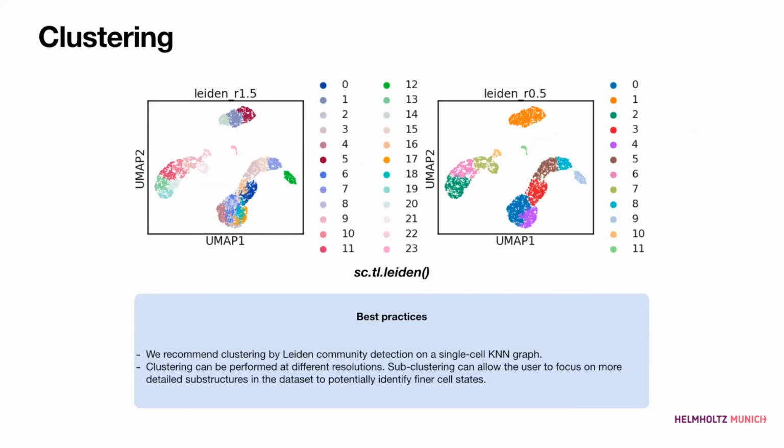Right. Good. Finally, this is the last big point that I wanted to talk about: clustering and also cluster annotations. So far I've focused on cleaning up our data and processing it in a way that we can handle it. Now comes the step where we actually start to look at what we have in our data, what kind of interesting features we find there. And one step that we usually do is clustering.